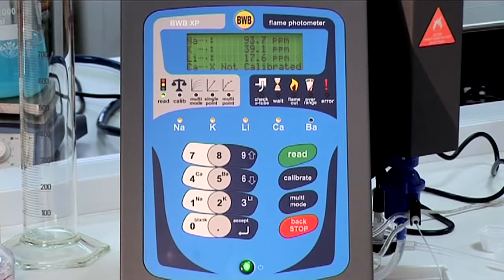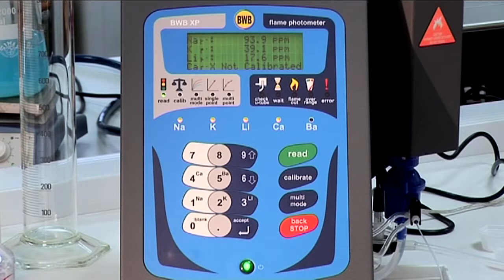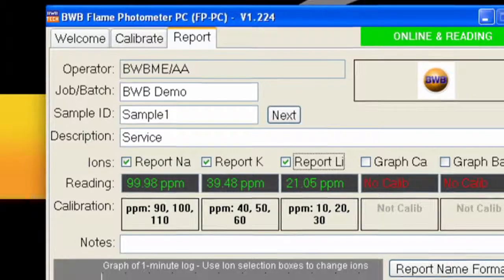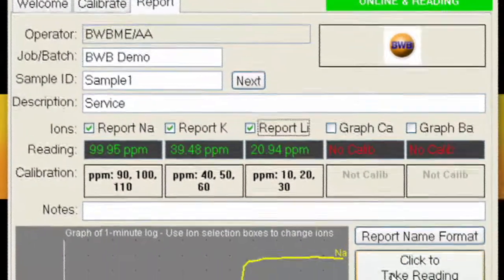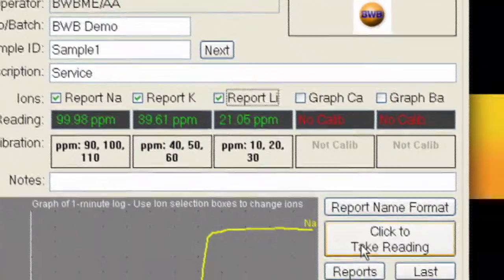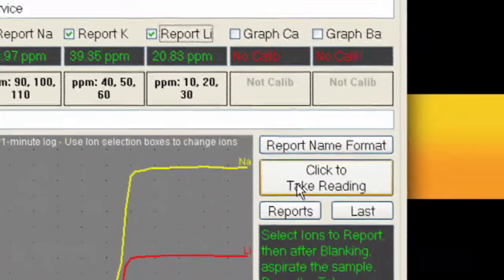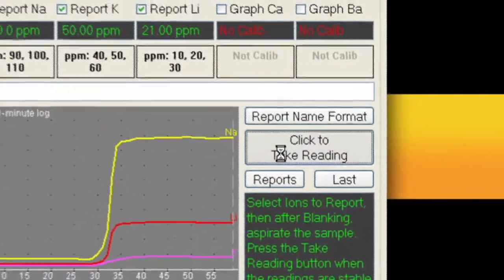Be sure to monitor both the BWB XP and the FPPC software to see when the readings both numerical and graphical have stabilized. When the readings are stable, press the take reading button.